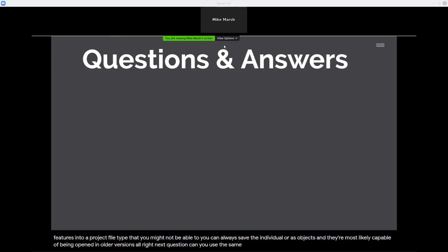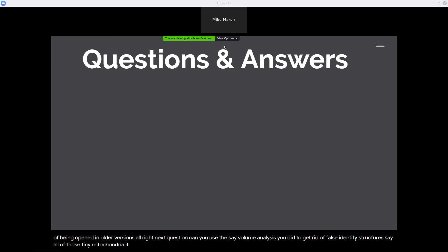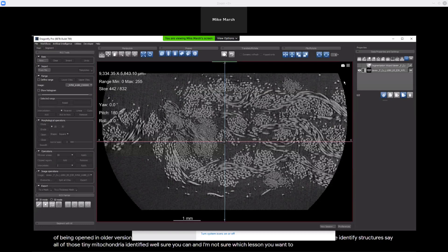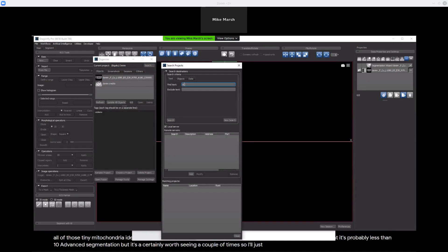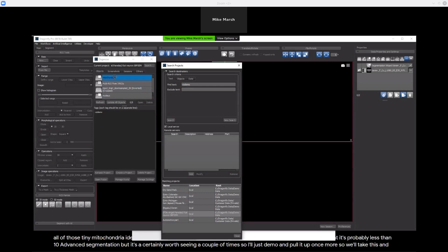Next question: can you use the volume analysis to get rid of falsely identified structures, such as all those tiny mitochondria identified? Sure you can. I'm not sure which lesson to point you to, but it's probably lesson 10 on advanced segmentation. Let me do a quick demo — I'll hit search and pull it up once more. I'll bring in the mitochondria.